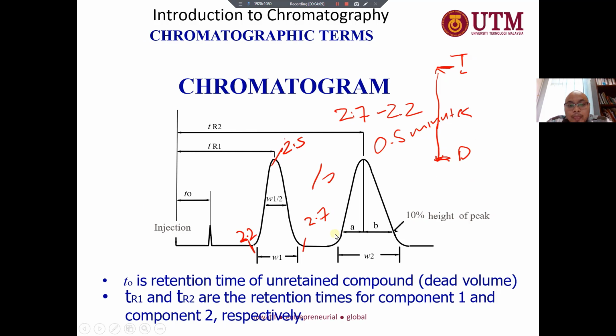Before forgetting, I told you about the baseline. The baseline is the straight line when there is no reading or response. So here is what we call the baseline.